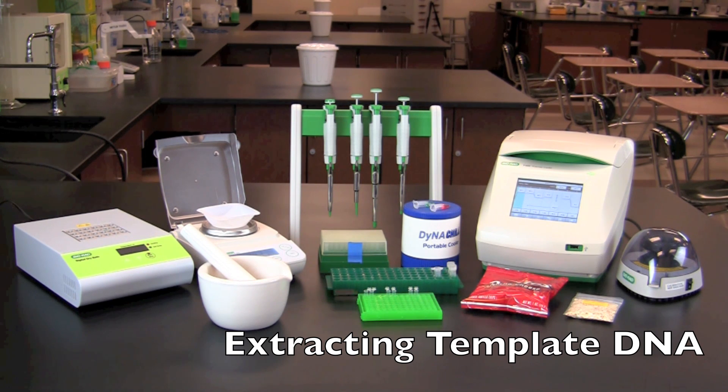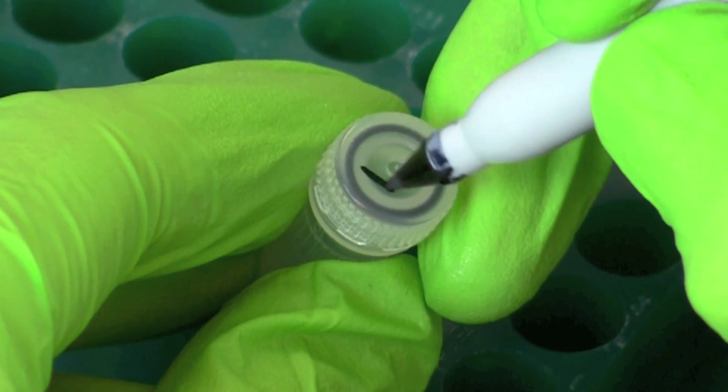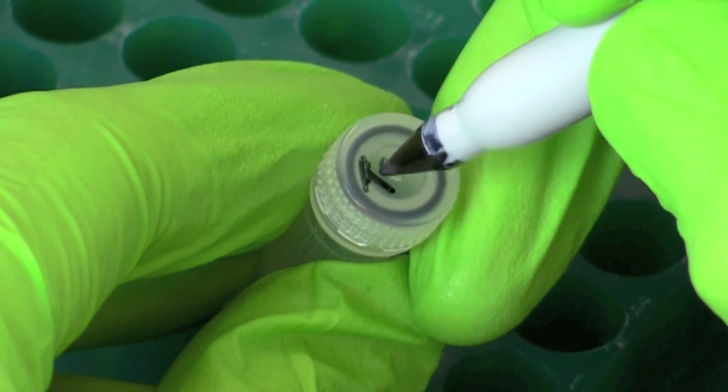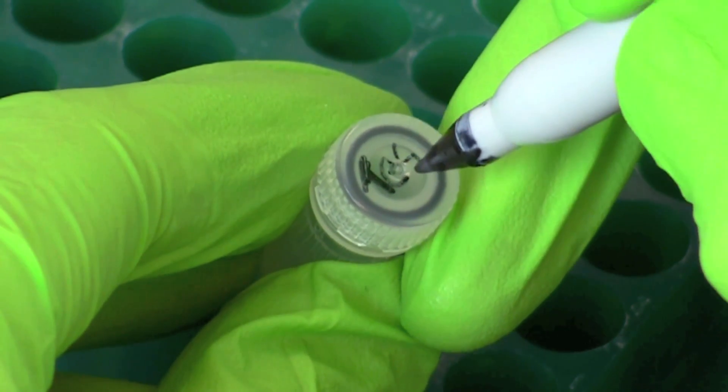The following procedure will allow you to extract template DNA from foods that you purchase at the store. Label one screw cap tube containing InstaGene matrix and the other non-GM.